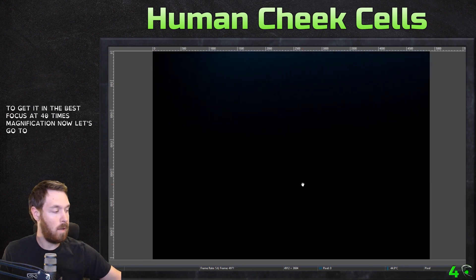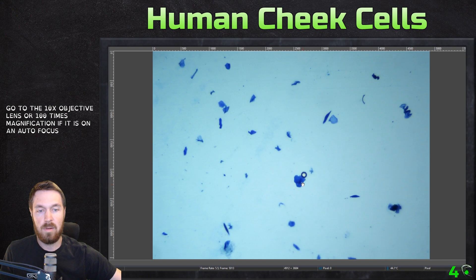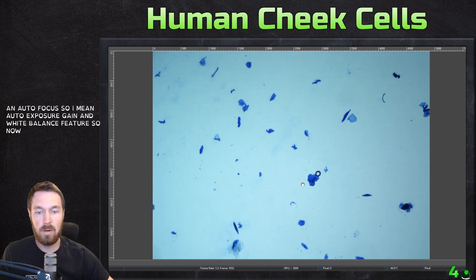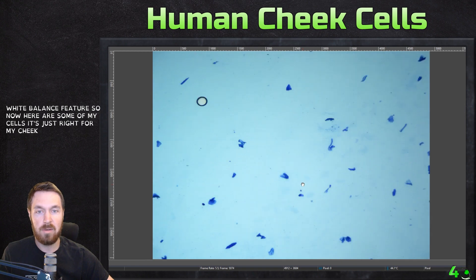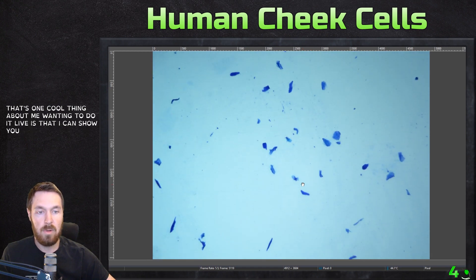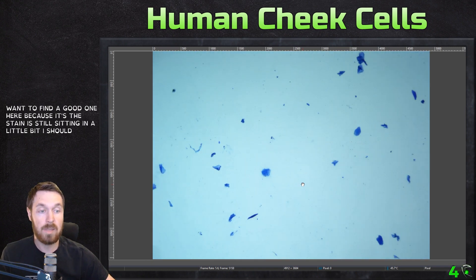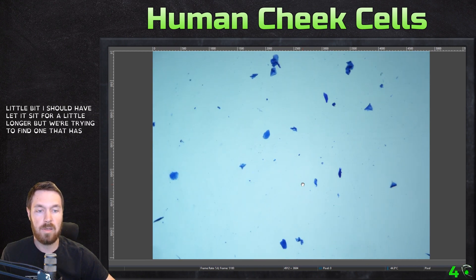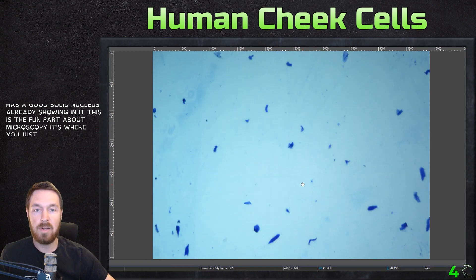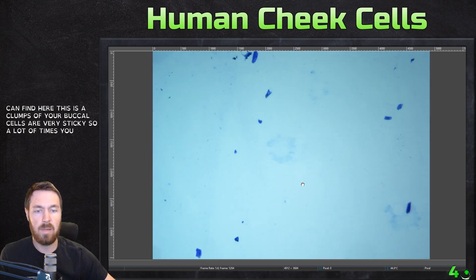Now let's go to the 10x objective lens — that's 100x magnification. It does have an auto exposure gain and white balance feature. So here are some of my cells, just right from my cheek. You can see how fast this can be done. I want to find a good one here because the stain is still setting in a little bit. I should have let it sit longer. We're trying to find one that has a good solid nucleus showing. Your buccal cells are very sticky, so a lot of times you can see them clump together.